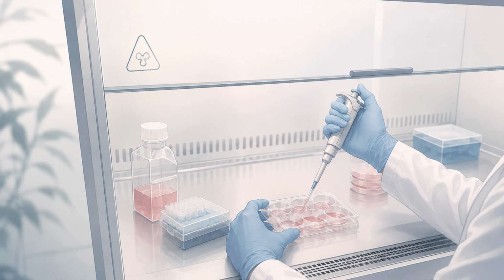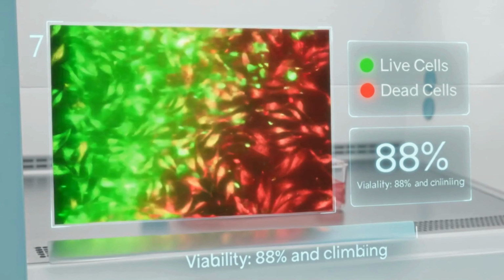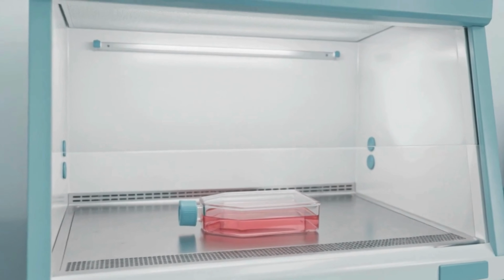A flask full of dead cells looks almost identical to a flask full of living ones. Under the naked eye, under a bright field microscope, after adding your drug, they look fine. But the data tells a completely different story. Today, how to measure cell life, death, and everything in between.